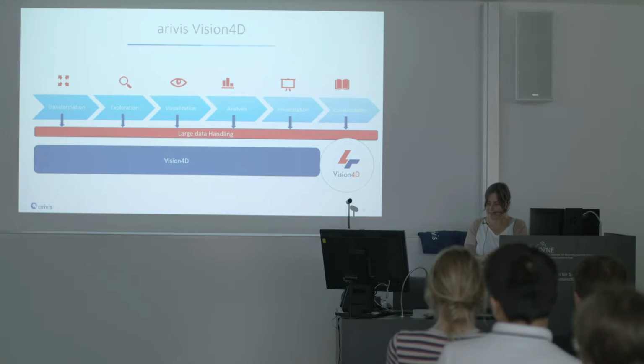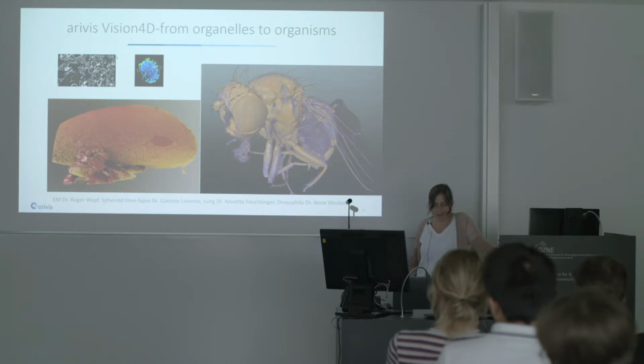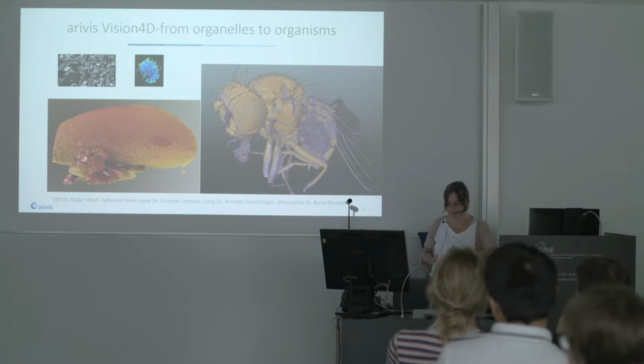So basically, if we look at ARIVIS Vision 4D, and we do so also in a live demo, what I've just said to wrap this up, you will of course use such a software maybe dedicated to the large imaging workflow, if you use the Zeiss Z1 or the LaVision Ultra microscope or any custom built SPIM.